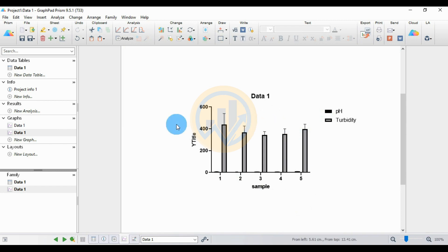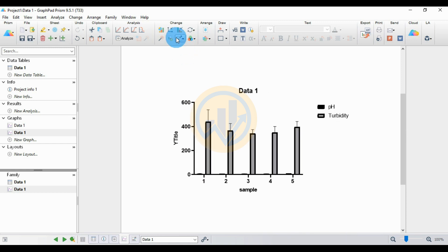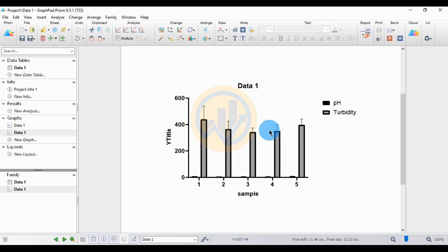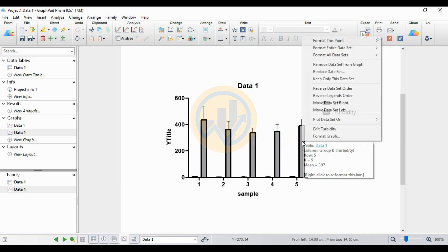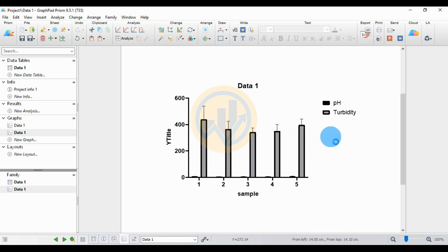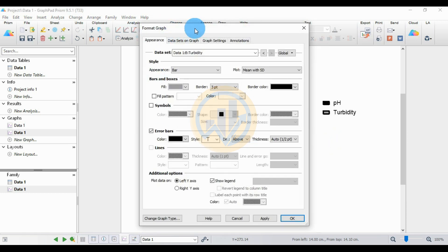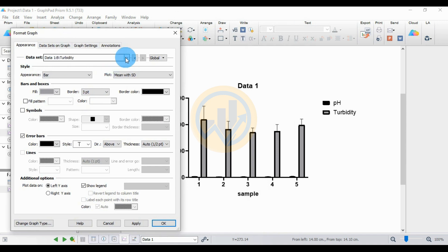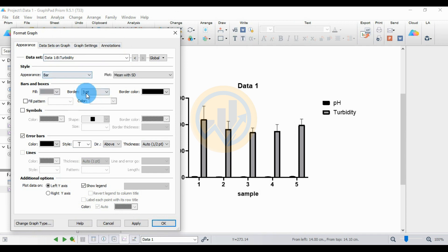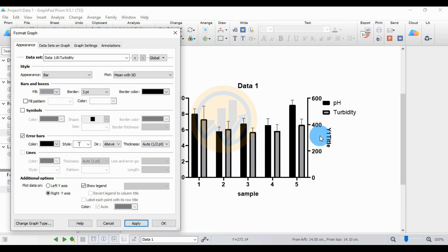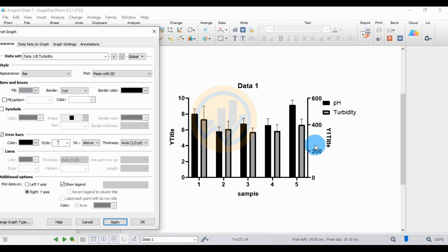Now customize this graph. First, increase the graph size. Then click on the turbidity bar graph, right-click, and click the Format Graph menu. A new tab opens showing the format of the graph. We have two datasets: first is pH and dataset B is turbidity. First, change and customize the turbidity dataset. Under the additional options, choose the right Y axis for turbidity. Then click the Apply button. Now the double Y axis is created in GraphPad Prism — the left Y axis is for pH and the right Y axis is for turbidity.